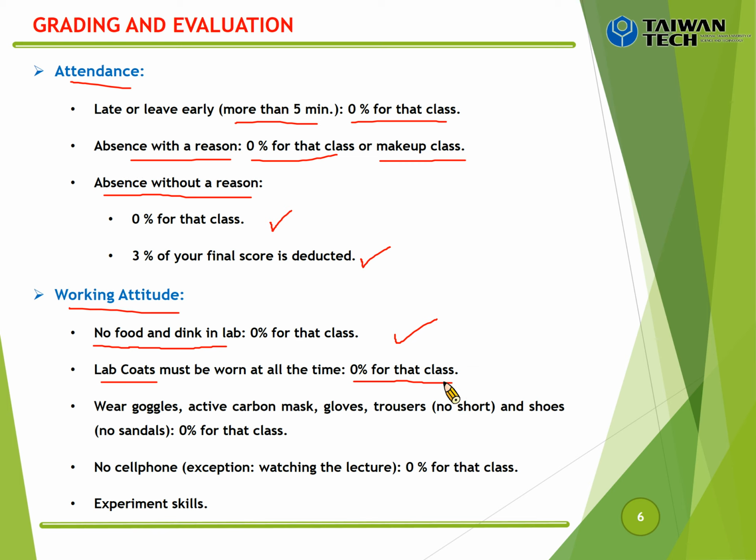Okay, and you also cannot do the experiment if you don't have the lab coat, and you should wear the goggles, you should wear the active carbon mask, you should wear the gloves, you should wear trousers, no shorts, and you should wear shoes, no sandals. Okay, if you don't follow this part, you get 0 for that class as well. Okay, and you also cannot do the experiment for that day.